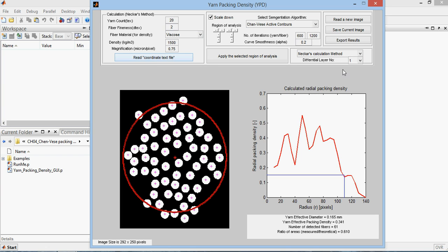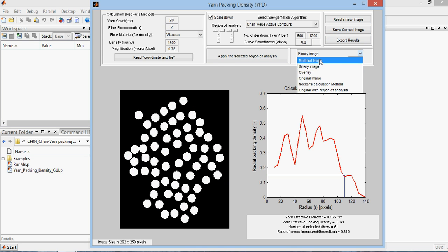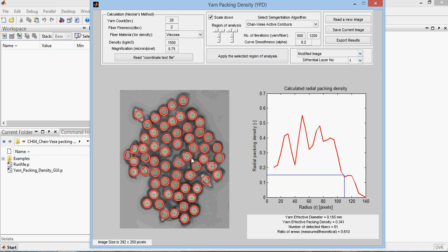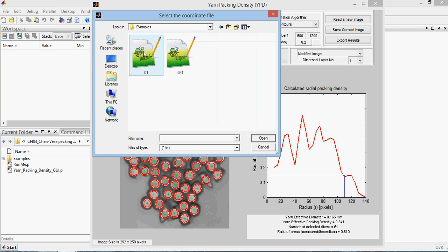Before going there, I need to make a comment that this program can save any current image, anything that you see here. You can see the overlay of the calculated method and the actual one. This fiber here, how it looks like and how it is replaced with a circle. You can just export the results. When you export the results, you get two files, one file that includes these parameters and the other file includes the coordinates. It is a coordinate file for the used picture. If you have this coordinate file beforehand, you can just read it.